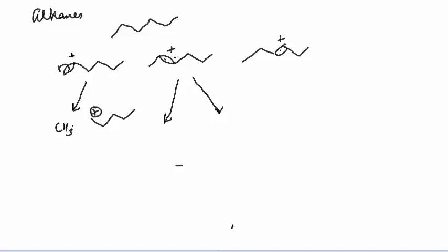But what I want to do is produce a primary cation and then a longer chain radical. And that will be this. When this odd electron shifts over to the third carbon, to produce a 4-carbon radical. And the primary cation then would be an ethyl cation.